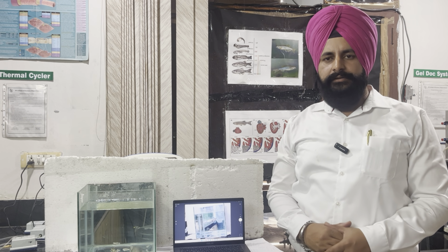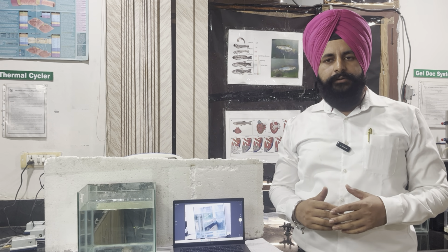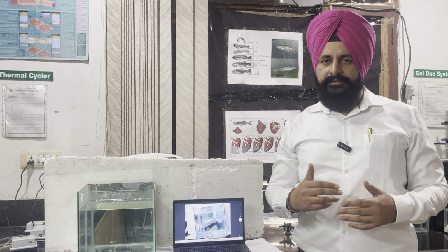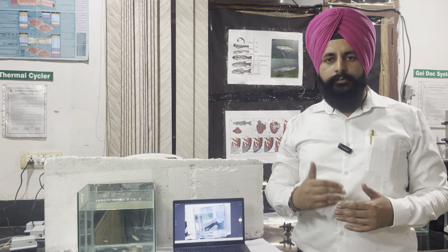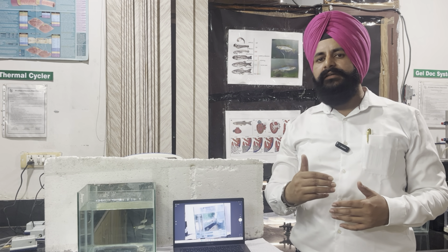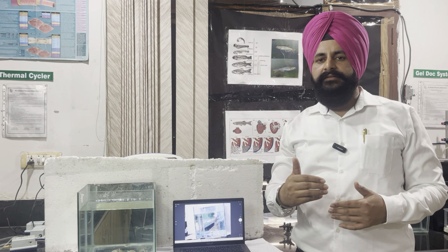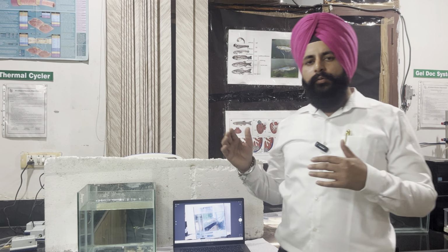Today I will discuss with you a very novel and useful experiment in which you can use a zebrafish. In today's experiment I will discuss two parts. First, how you can induce stress in zebrafish, that means how you can induce anxiety-like behavior in a zebrafish, and second, if you induce it, how you can analyze the effectiveness or efficacy of your drug which can act as an anti-anxiety drug. So dear friends, this is the whole experiment.